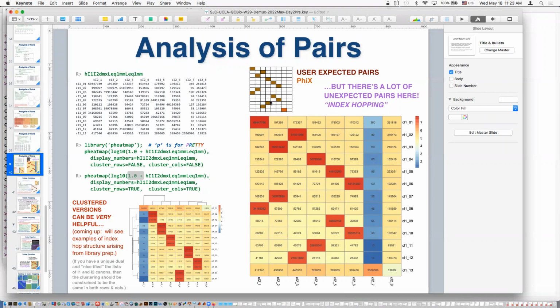Anyway, we obviously can't really know for certain how much is in here. We can kind of estimate it, and our R code isn't going to really estimate it. But if you had to estimate it, you would extrapolate something like, given the other nearby cells, how much do I expect with this file? And then you would subtract out that expected amount from the total here.